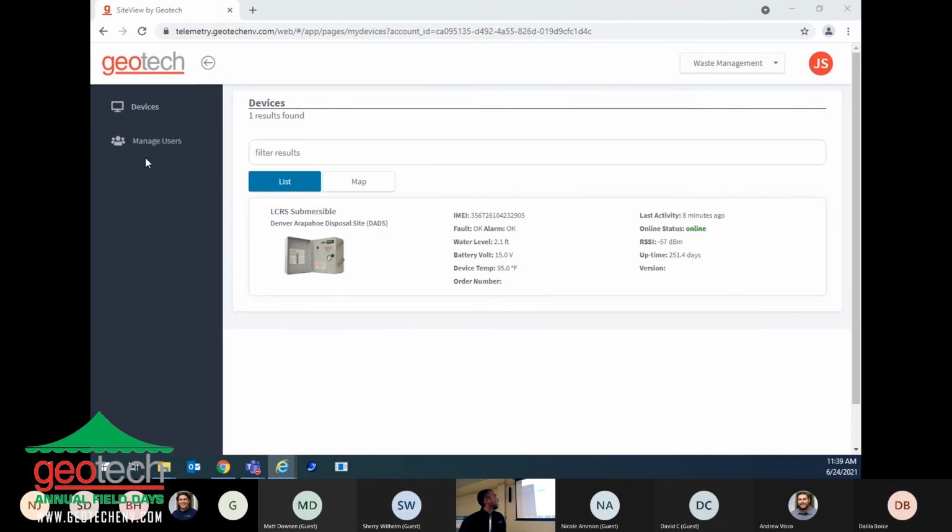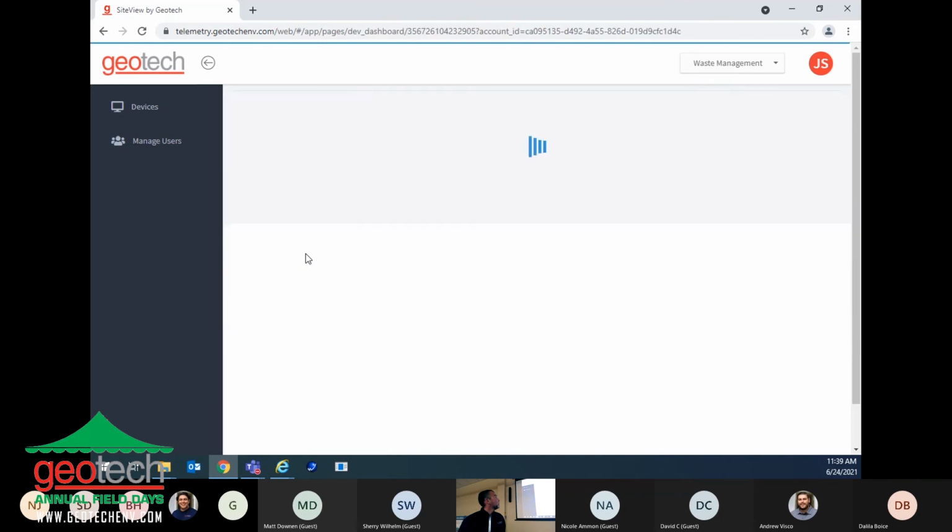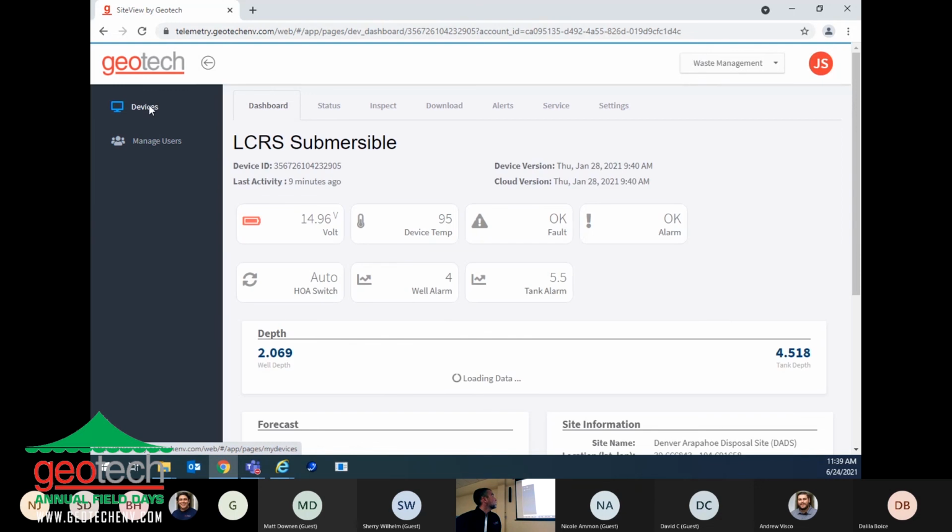All right, so right here, we're going to look at one site. This is a waste management site, and we have one device found. So right here, I have my box, and I click on my box. And this is our view, what it pops up. Notice over here, I can manage my devices, and I can manage my users. So I can look at my devices, if I have a list of devices, and sort those. I can manage my users.